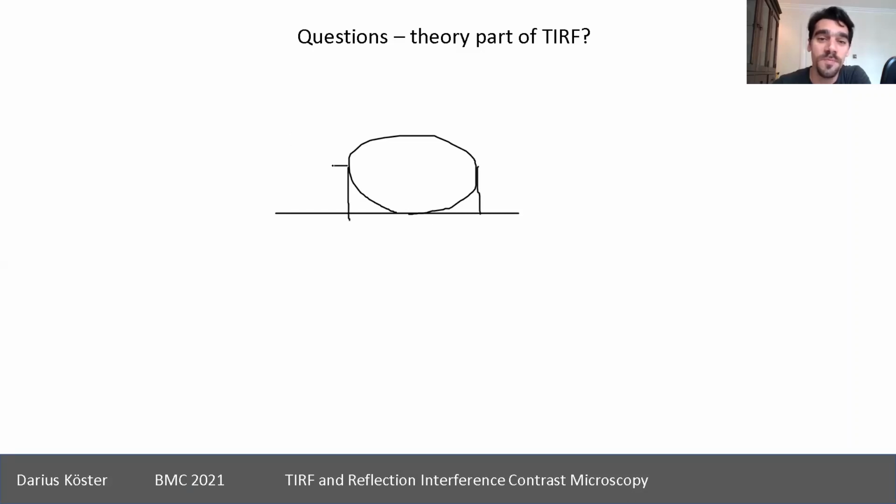The important point is, let's say it's a 10 micrometer diameter bead, then at half it will be 5 micrometers high. So you want it to be really tall compared to the supposed penetration depth. Because then what happens is, if you change the color.